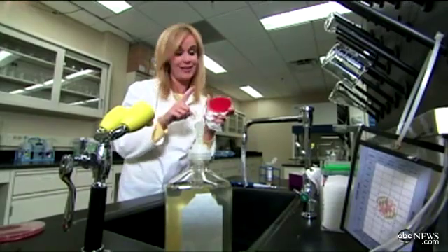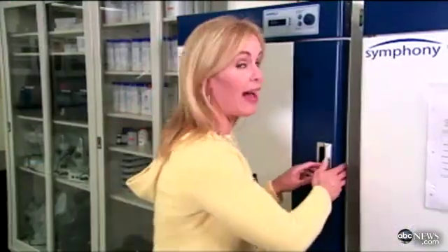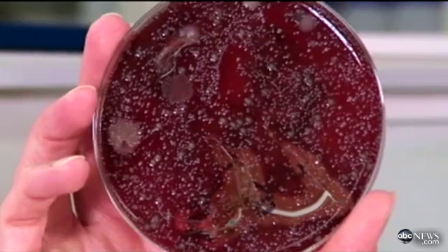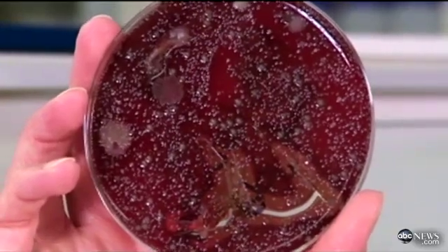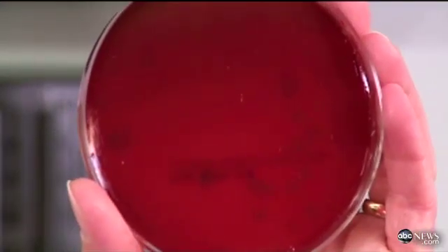And I can't wait to see the difference in what grows. We're back at the lab, and I've got something to show you. When I washed my hands for just seven seconds, look at this moonscape of filth that was still left on my hands. But when I washed thoroughly for 20 seconds, check it out — clean Petri dish, clean hands.